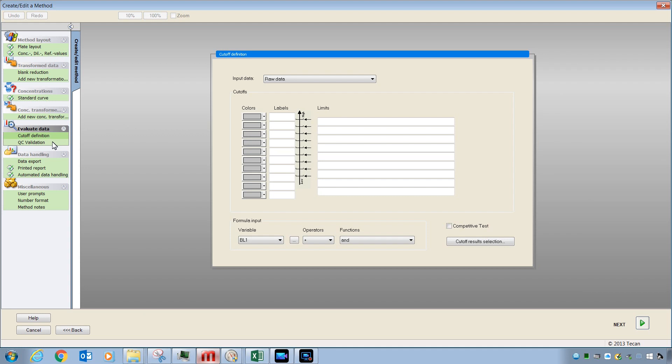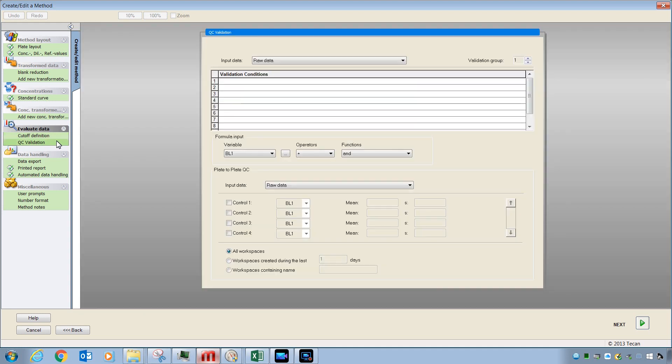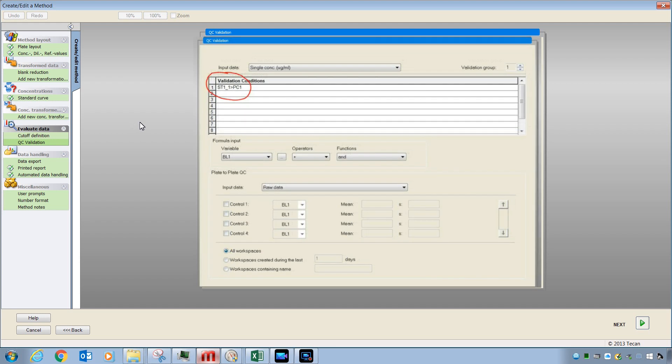The QC Validation feature is where you can add calculations like this one and get true-false answers for your data.